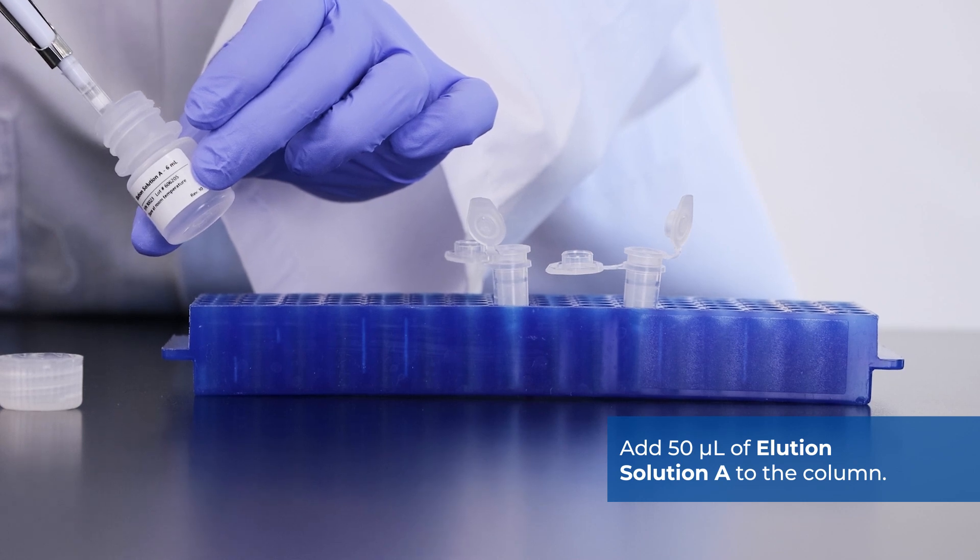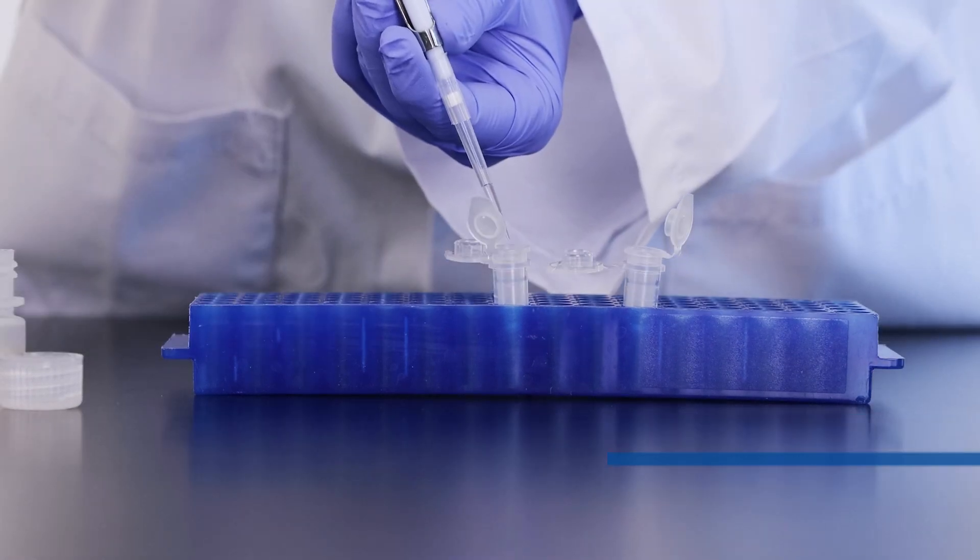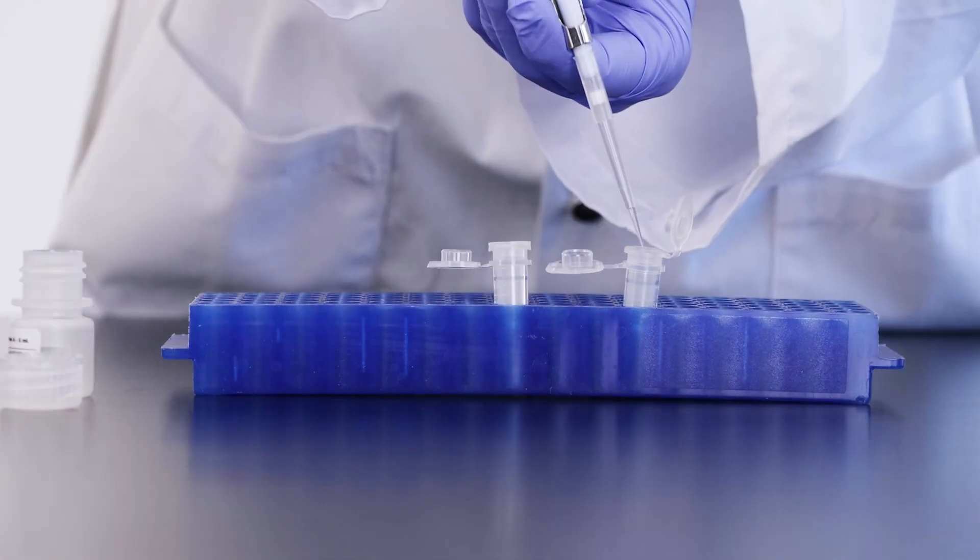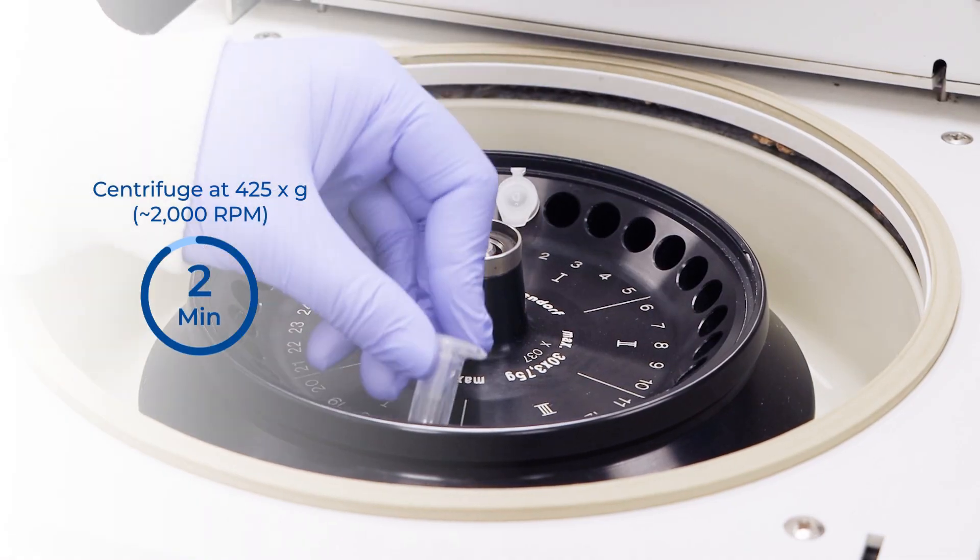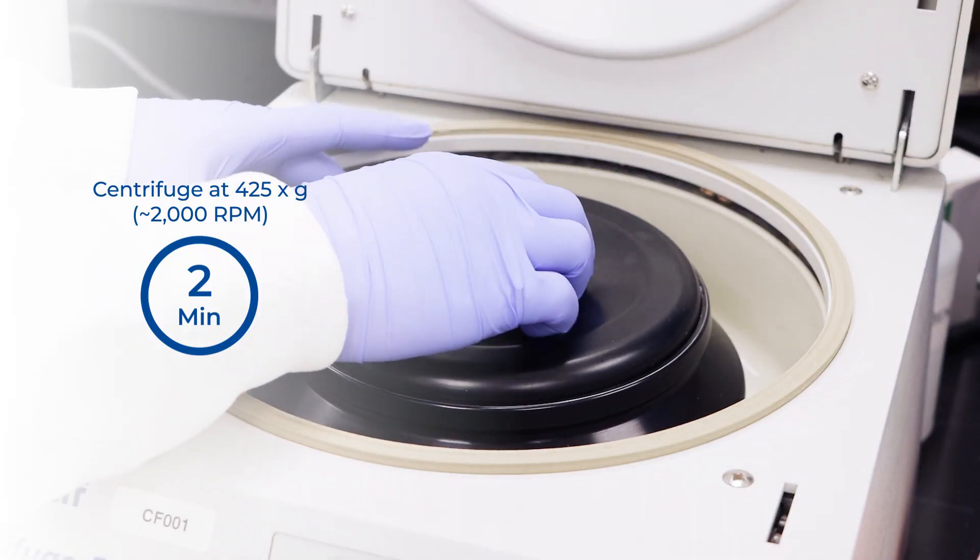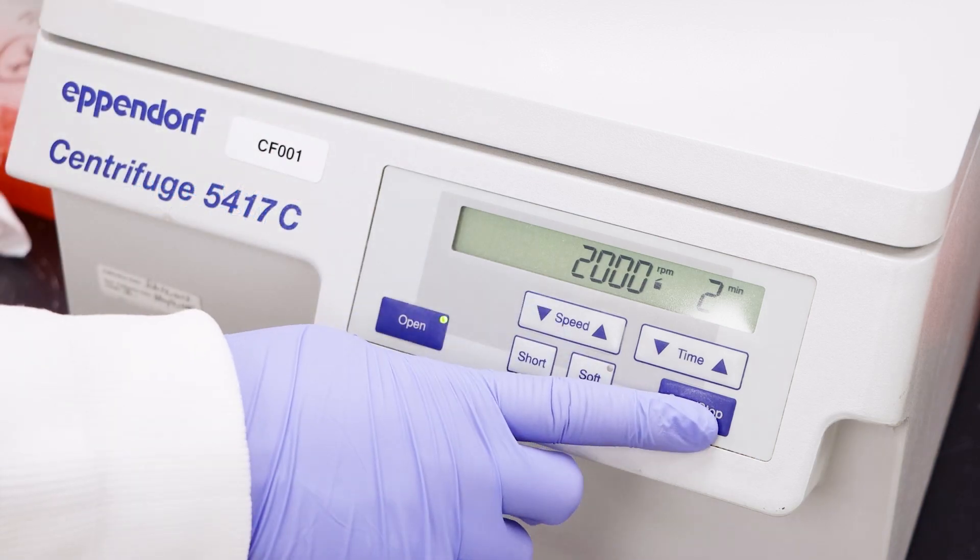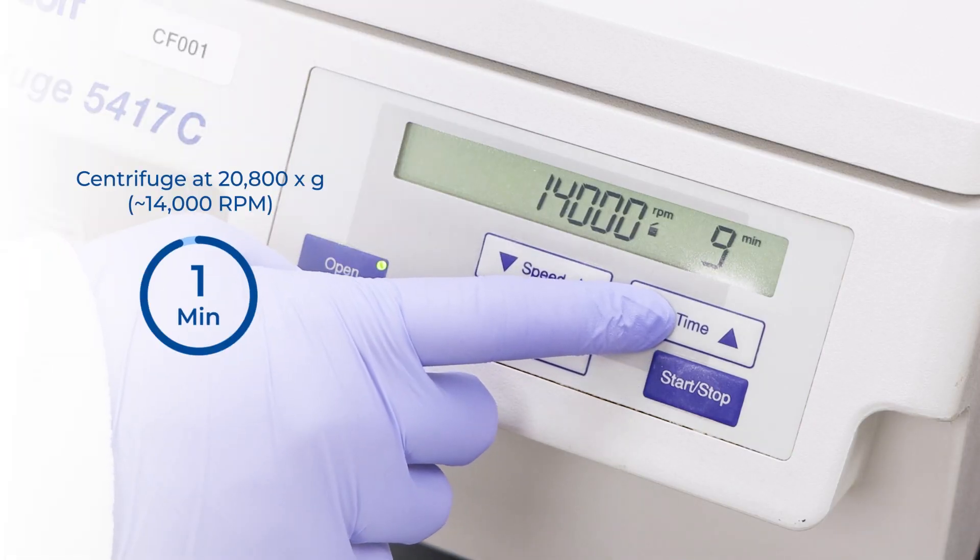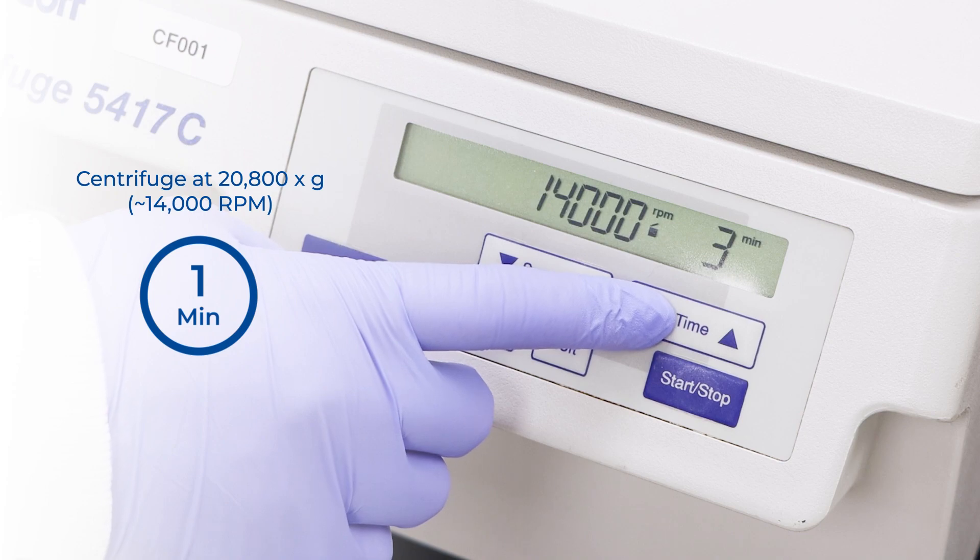Add 50 microliters of elution solution A to the column. We do not recommend eluting the RNA in a lower elution volume. Centrifuge for 2 minutes at 425 G or 2000 RPM. Followed by 1 minute at 20,800 G or 14,000 RPM.